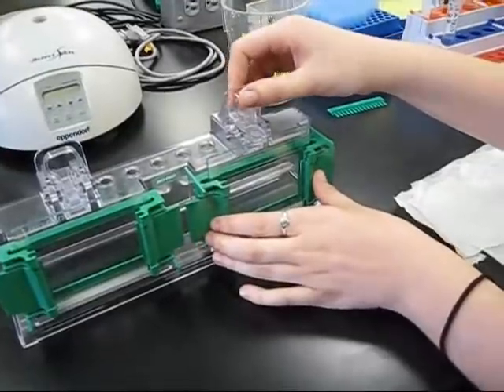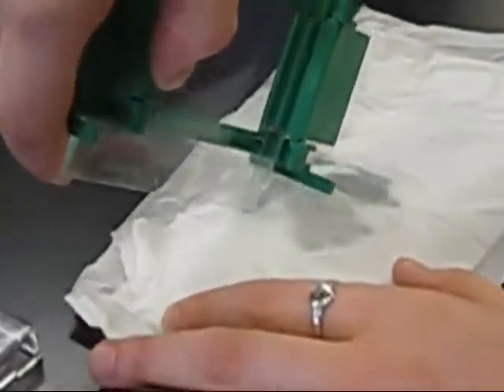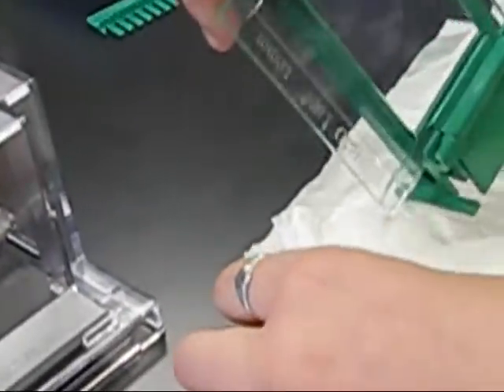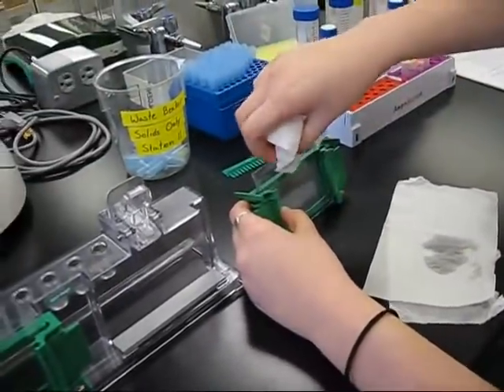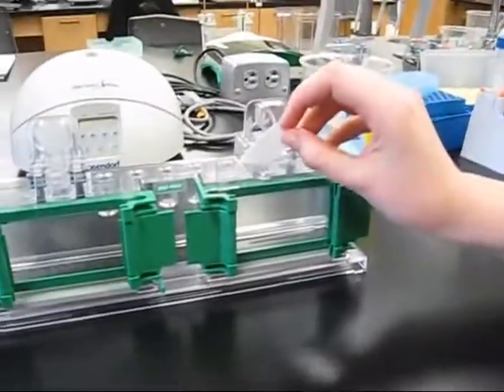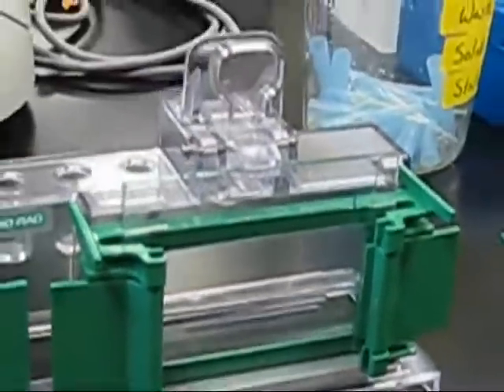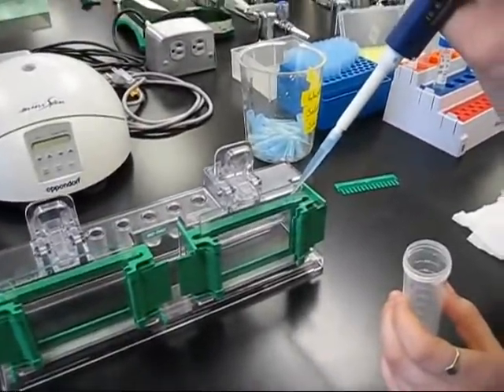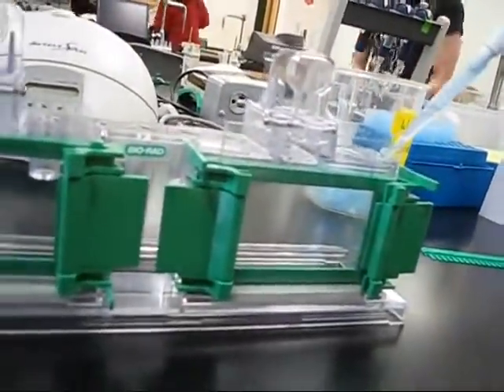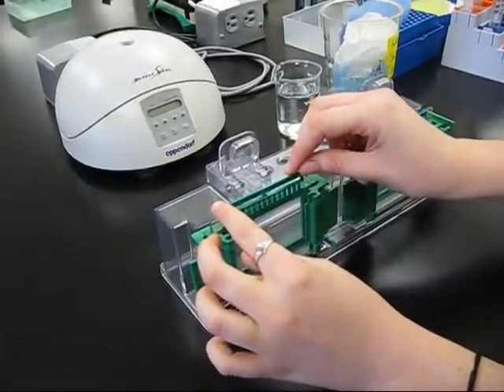Once the running gel is set, remove the isopropyl layer by tipping the casting assembly and pouring the gel onto a KimWipe. Then absorb any remaining alcohol by cautiously inserting a piece of filter paper between the glass plates — avoid touching the gel with the filter paper. Using a plastic pipette, add the stacking gel solution to the gel cassette until the level almost reaches the top of the short plate. Gently insert the comb in between the two glass plates, seating the comb by aligning the comb ridge with the top of the short plate.